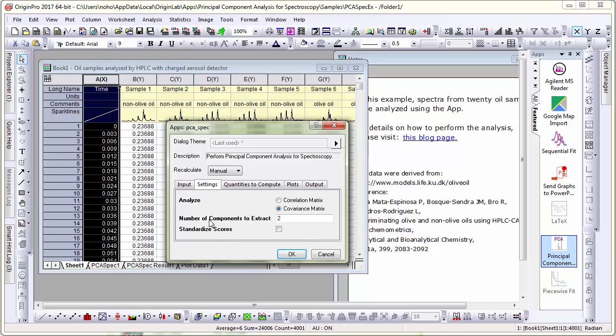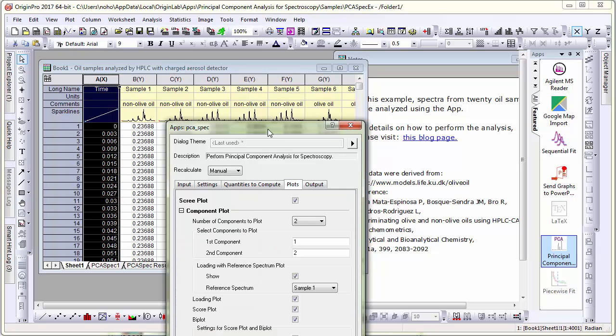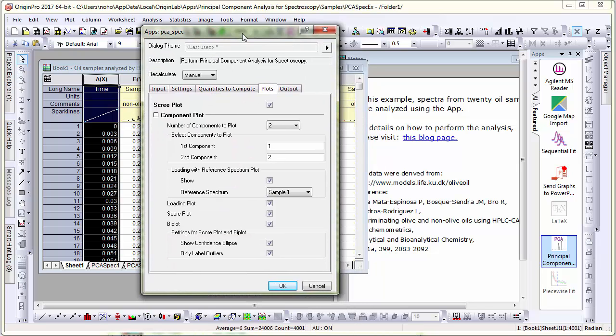Under settings, the number of components to extract has been set to 2. And quantities to compute, I want scores to be computed. And in the plots tab, I am asking for a score plot and I am also asking for confidence ellipse.